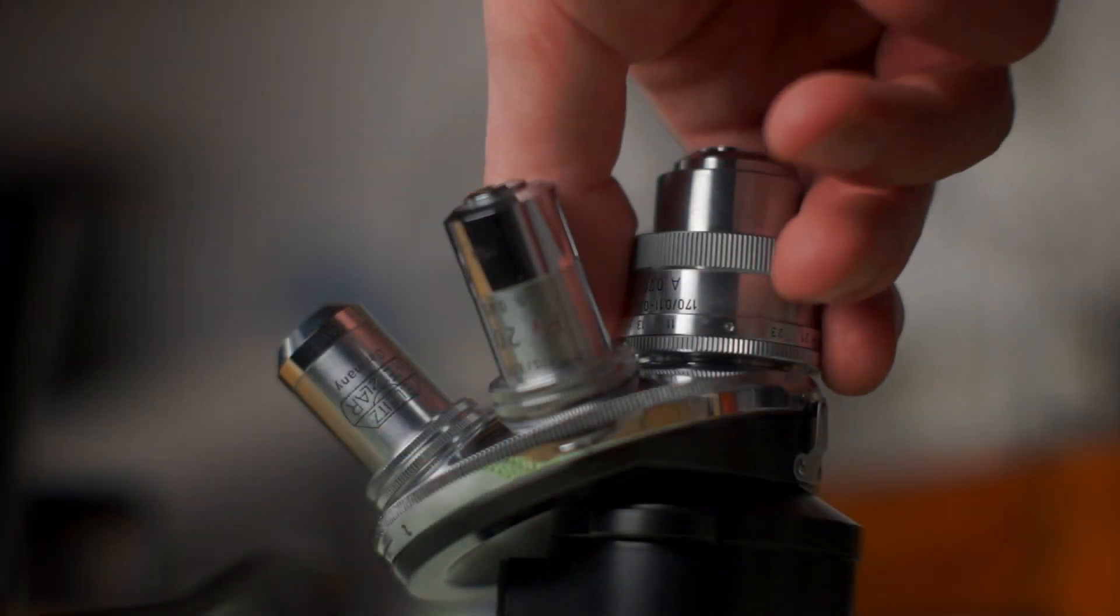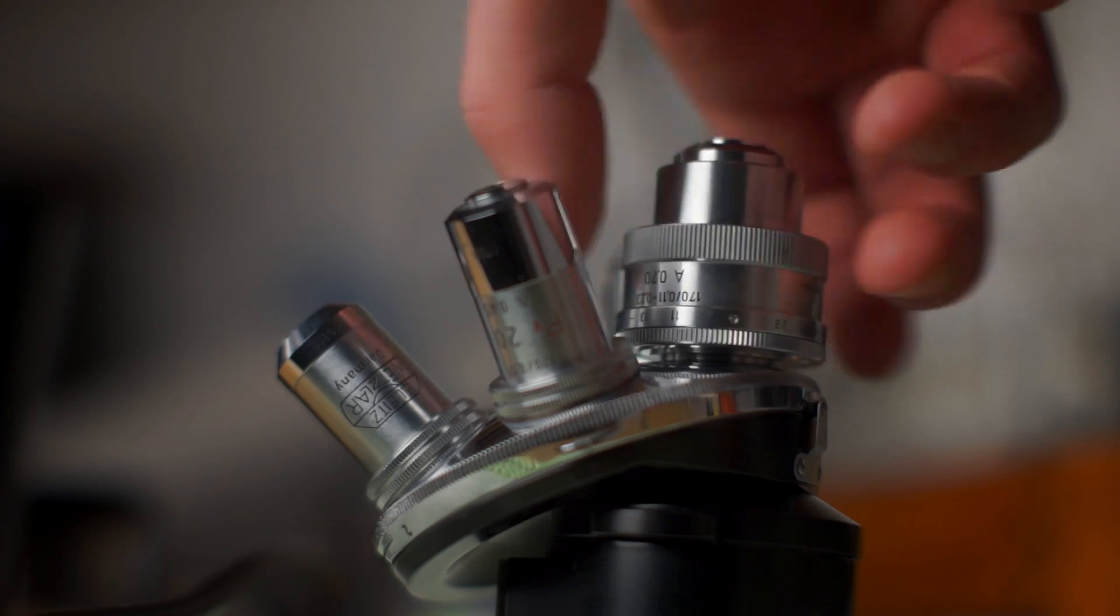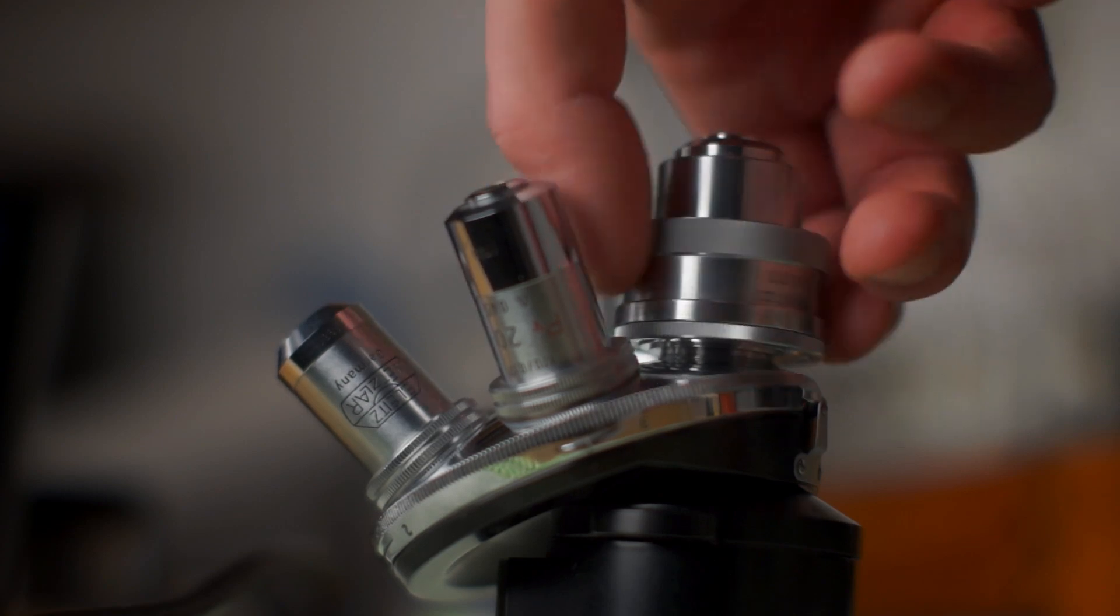After we have modified the screwdriver, it's time to remove the objectives from the revolver. The lenses were stored in objective storage cases to protect them from harm during the servicing.